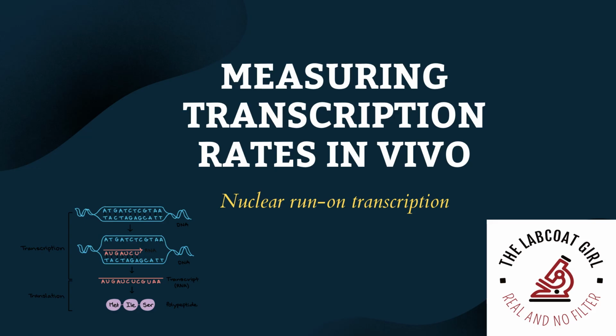So today's video is on nuclear run-on transcription, which comes from molecular biology. And this technique is basically used to study gene expression and regulation. If I have to make you understand in a line or two, I would say it's a laboratory technique which is used to study which genes are actively being transcribed in a cell at what rate, and it provides you a snapshot of the genes that are currently being expressed. So with this, let's move on.